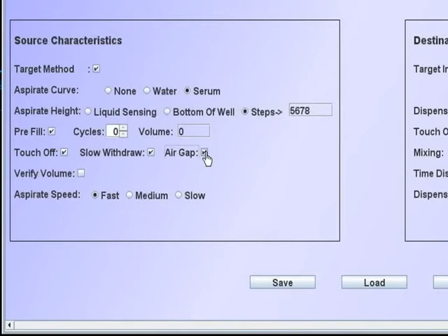If this value is changed or not used, the meniscus detector will be off by that amount unless recalibrated.